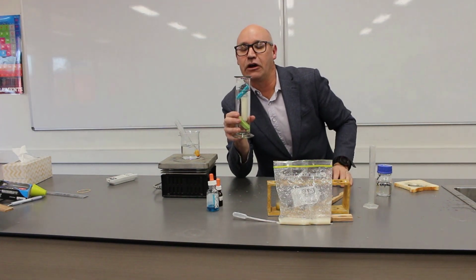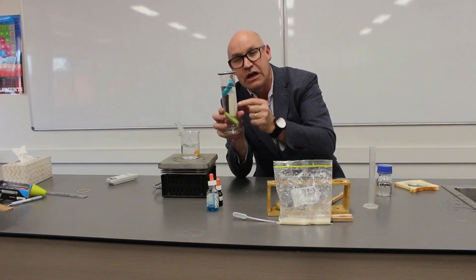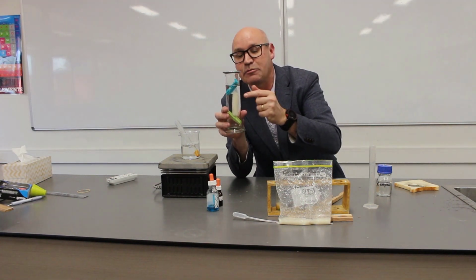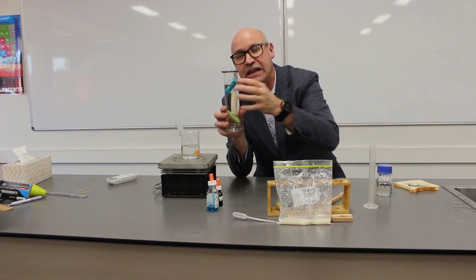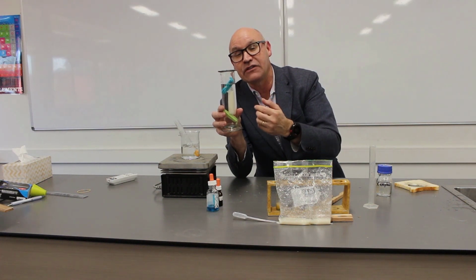What do you expect is going to happen? Remember, these holes are incredibly small. Too small for starch to be able to go out of the tube and into the water that surrounds. Make a prediction about what you think we're going to see.